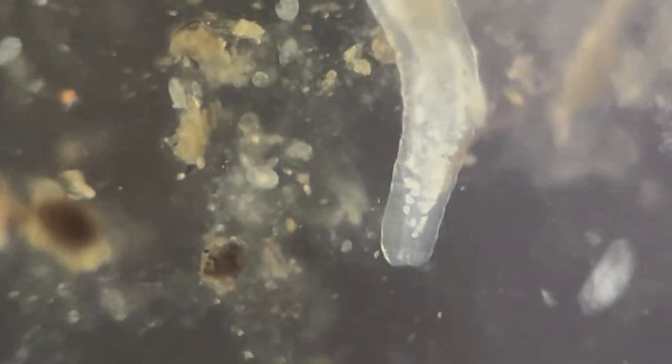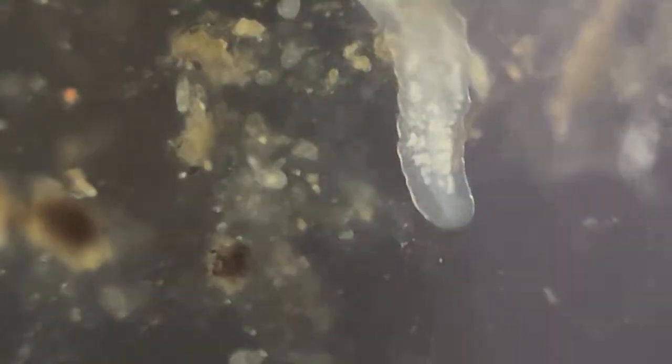So I'm going from 4x objective to 10x objective, and see if we find anything better. Now we see the eggs more clear.